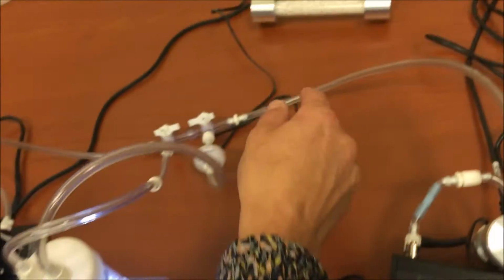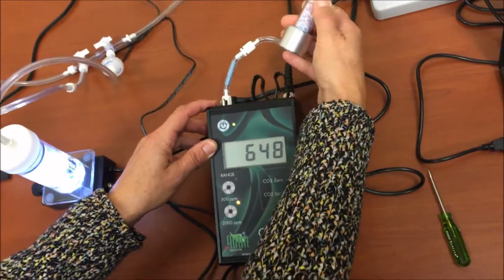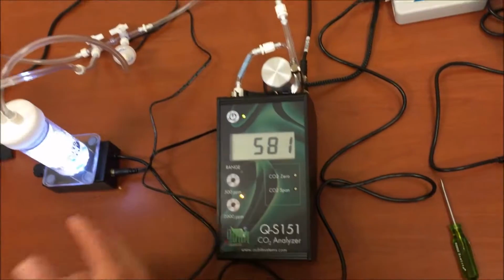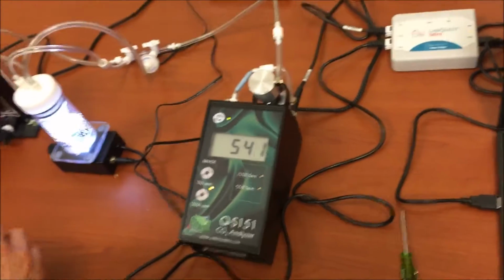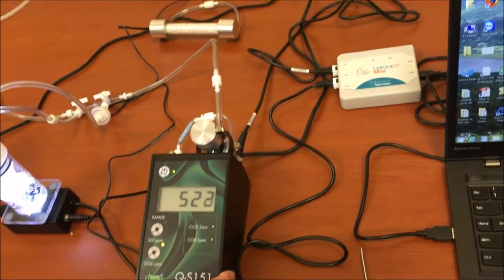Then we also have the CO2 analyzer, as I mentioned. For the CO2 analyzer, the gas has to go through a drying column, which is purple. It's got an indicator: it's purple when the gas is dry, and when it absorbs a lot of moisture it will turn pink, and that's the indicator to change it. And then gas vents out.